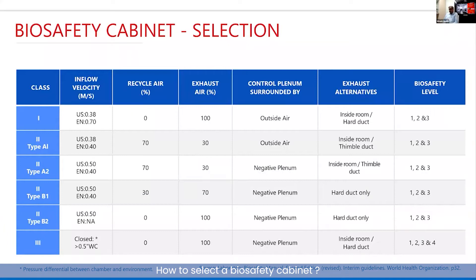What I'm giving you here is a summary of what the different biosafety cabinets mean and where they can be used. The velocity is defined by the standards — the standards we are talking about are NSF 49 and the EN standards — and the inflow velocities are clearly defined.